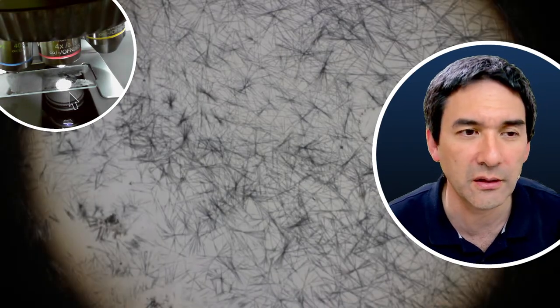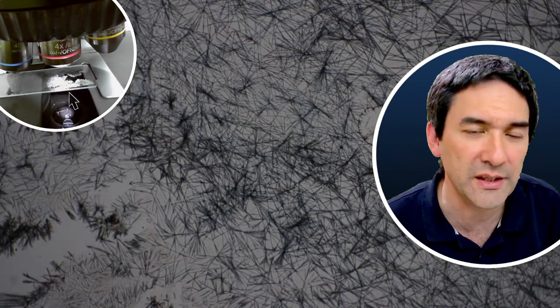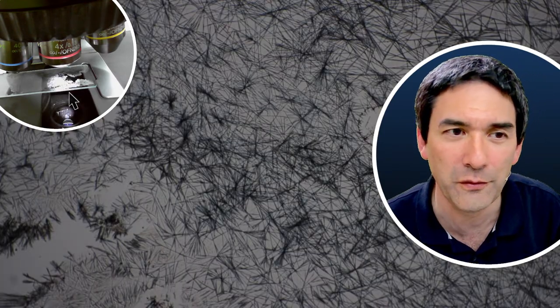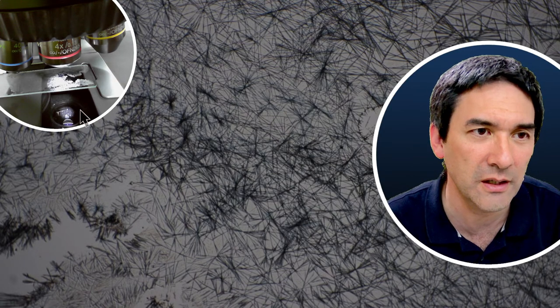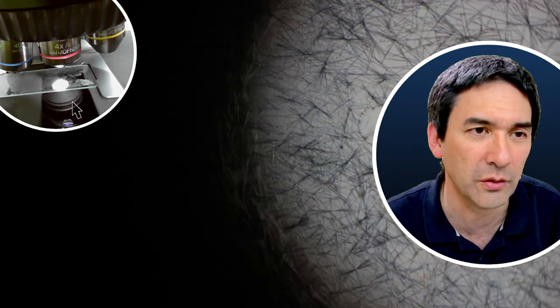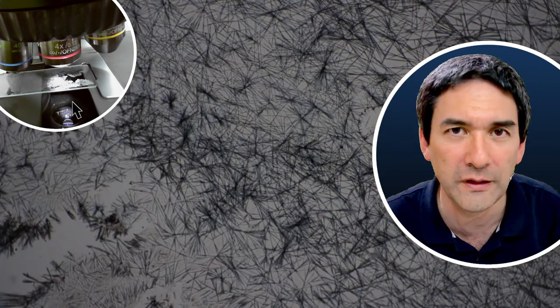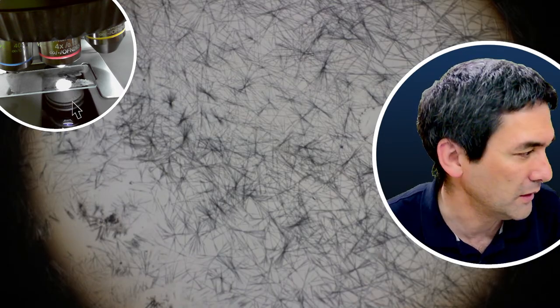And you're going to see that the whole thing is in a circle because you need to swing out the condenser, and then you have the full field of view again. Look in the corner what happens here where the arrow is. Okay, look, it's the condenser that I can swing out and then you get the full field of view. So just in case you were wondering.